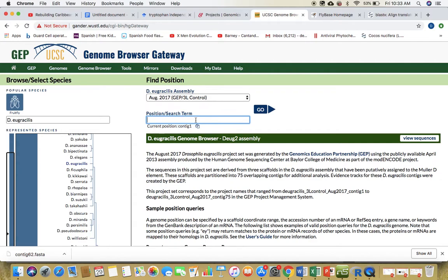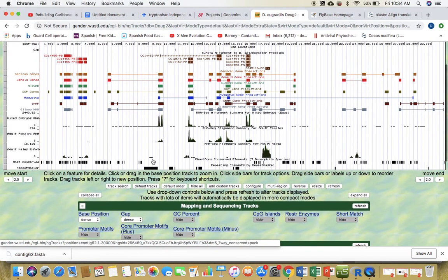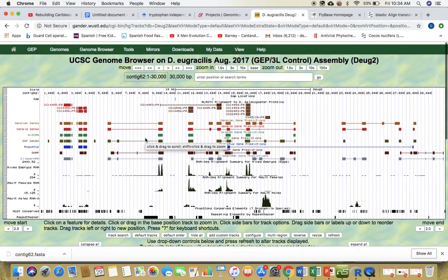The Contig that I'm going to annotate is Contig 62. So I can put Contig 62 in that box and press go, and it'll take me to the alignment page where we have color diagrams, with the possibilities of these different databases, comparing it to Drosophila melanogaster to see which ones could make the best comparison visually for Contig 62.